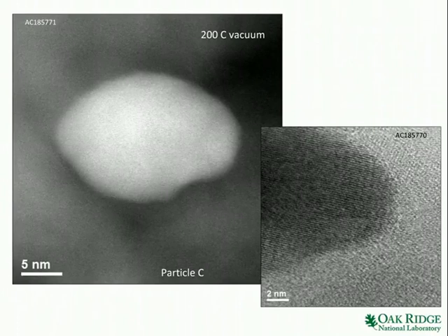It also shows lattice in the dark field. It's a little more easily visible. These particles are fairly large for lattice imaging or atomic column imaging, even in the aberration-corrected microscope. But the bright field images show those lattice fringes in the particles very, very nicely. So this just shows that we do have lattice directly out to the edge. There's no apparent oxide on the surface.